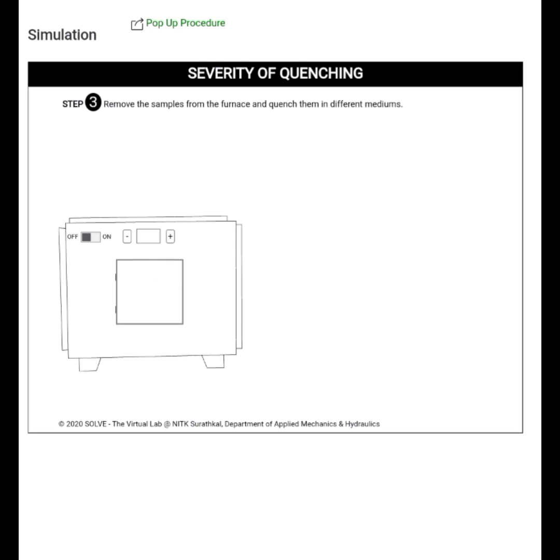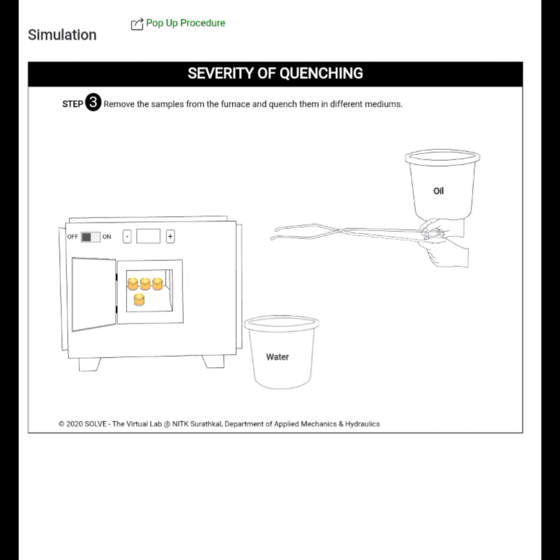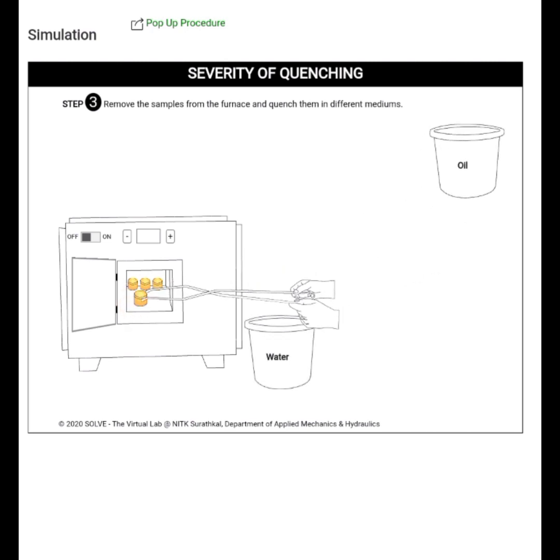Remove the samples from the furnace and quench them in different mediums. The first sample we put in oil. The second sample we put in water.